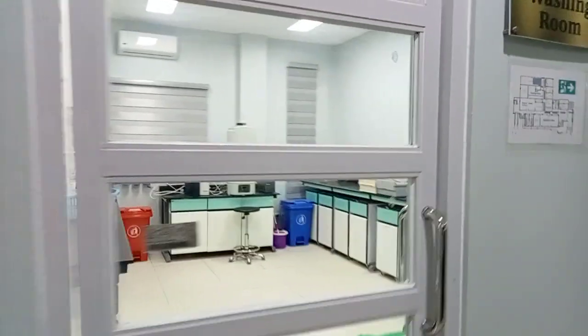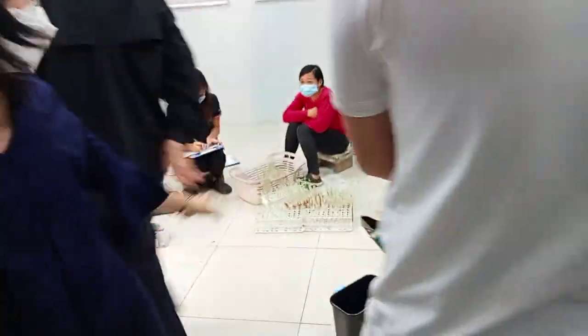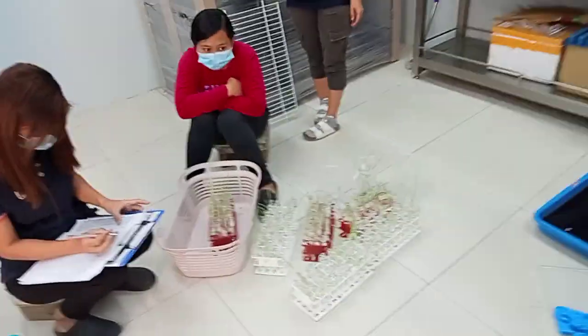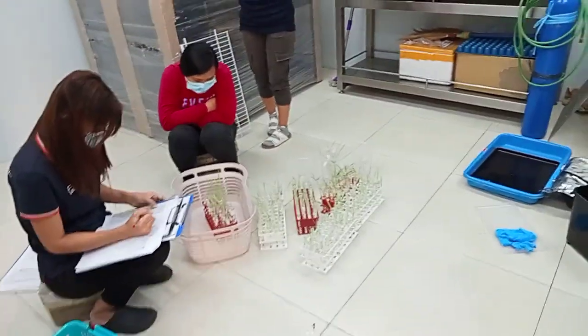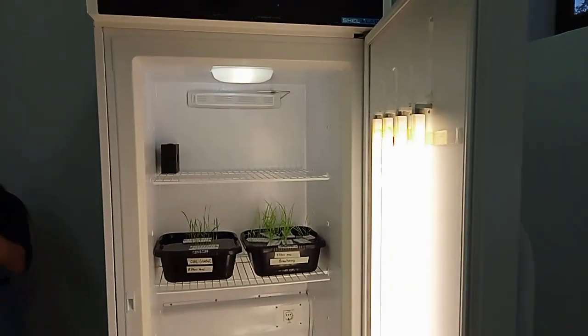Washing room. So for now we are studying root growth. We actually finished evaluating the root architecture of our sample. So we use the grow chamber in order to grow our plants.